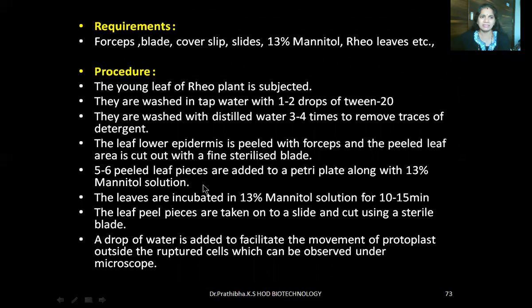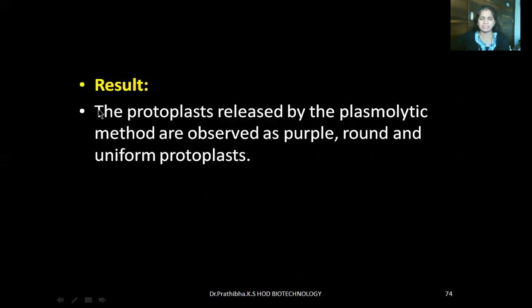Then after that, you need to write requirements. Here we are taking forceps, blade, cover slip, slides, 13% mannitol, Rhoeo leaves, etc. Then the procedure. This is the procedure you need to follow to show to the examiner. Then this is the result.